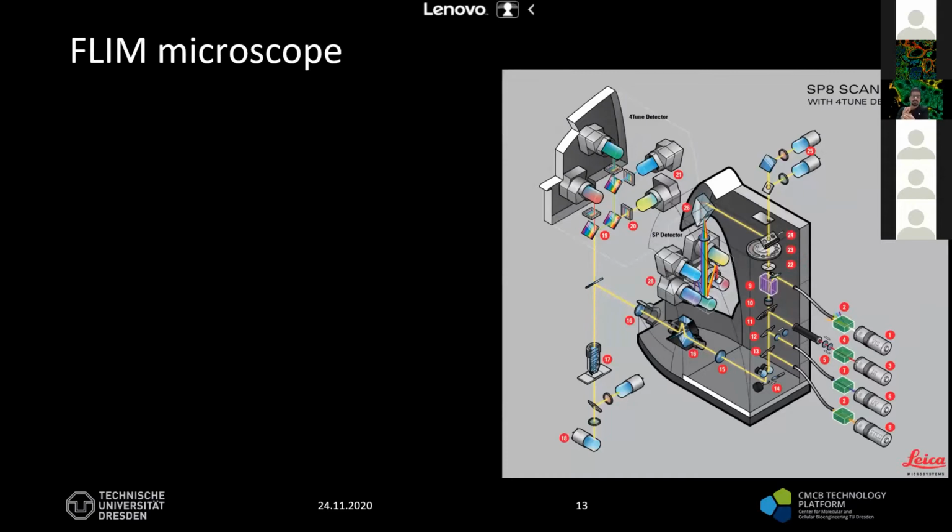So in this session we are using the Leica SP8 FALCON system. It's a complex system, as you see here. Our system doesn't have the STED laser, but we can do fully spectral confocal imaging, and for sure confocal FLIM, but that's not really our interest today.